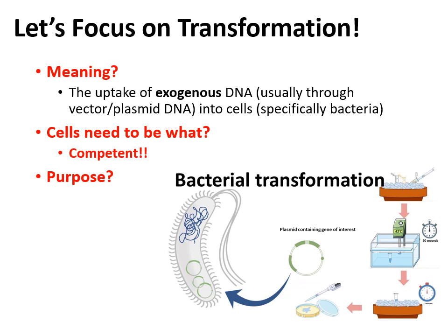A lot of you have probably done transformation before in previous classes. Transformation is one of those very versatile experiments that no matter which part of the sciences you go into, you end up using it tons of times. That's why we cover it in courses like Bio 171 or 181. We cover it in genetics lab. We do it again if you take molecular, such as Bio 327, 325. If you take cell biology, we do it there as well.